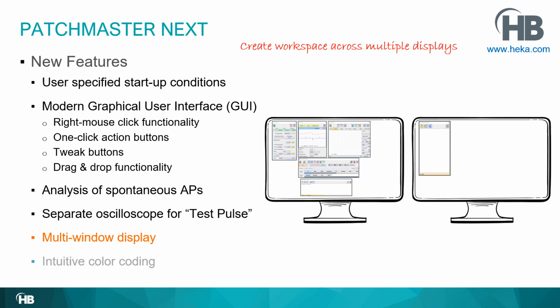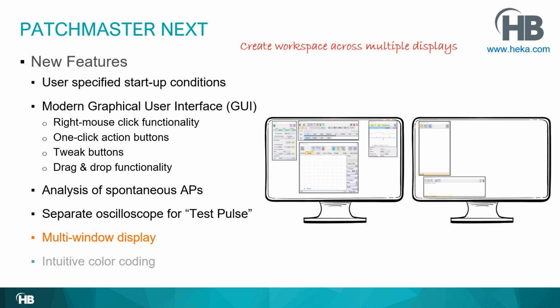Now you can go and change whatever you want. You can move, for example, the data tree over here. You can readjust the notebook window. You can adjust anything you want. And I would recommend doing so, but then also don't forget to save the configuration file like I explained in the beginning with a new name.